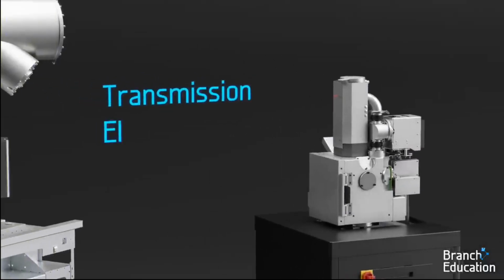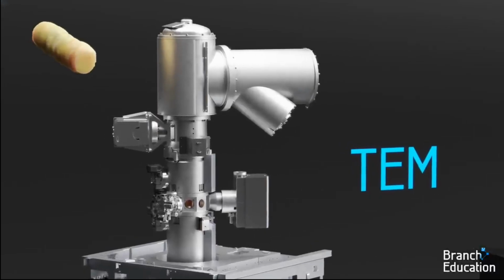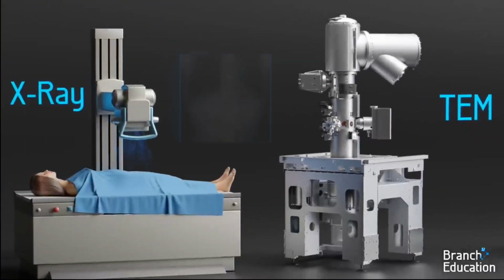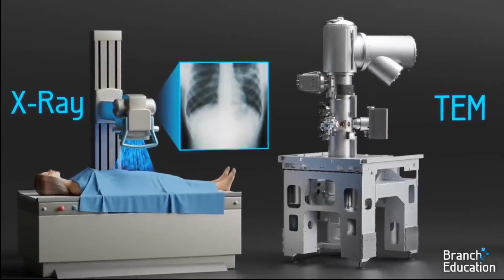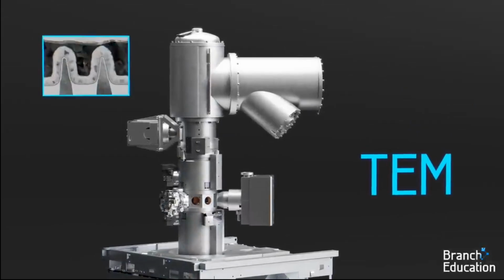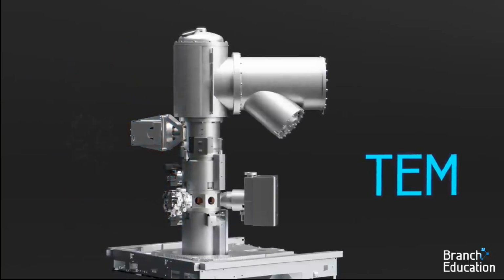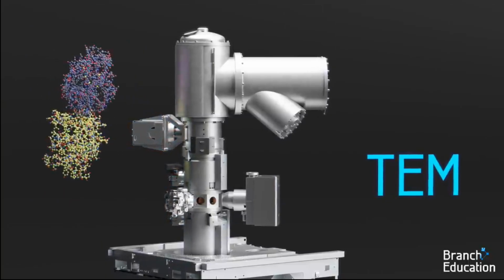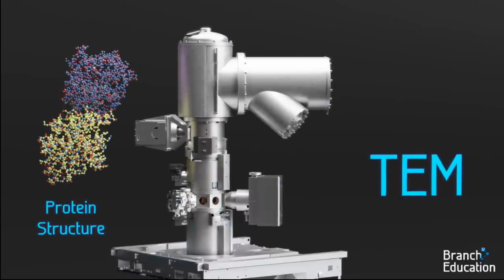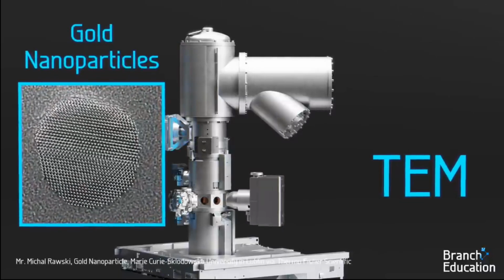is the Transmission Electron Microscope, or TEM, which is used to take images of structures that are inside materials, much like an X-ray machine takes pictures of the bones inside our bodies. For example, TEMs are used to take the pictures of these sections of a transistor. However, in other domains of science, TEMs can be used to take images of proteins inside mitochondria, the powerhouse of the cell, or of nanoparticles of pure gold.